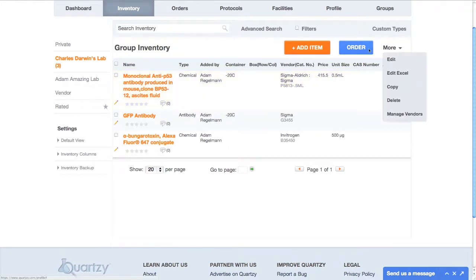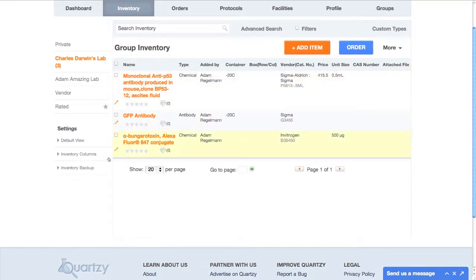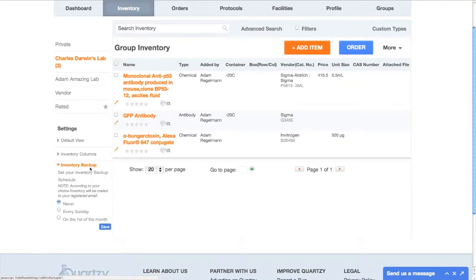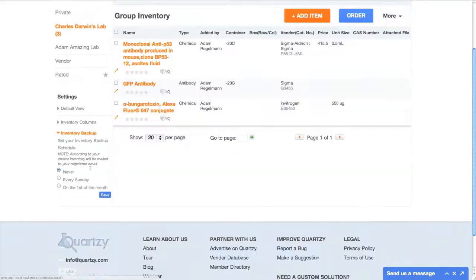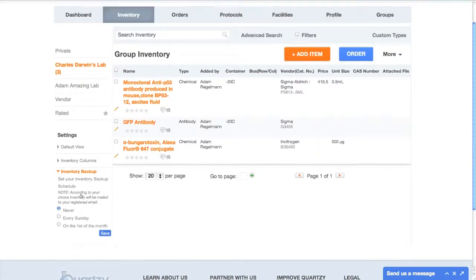Some scientists want to keep a local backup of their inventory. That's no problem with Quartsy. All you need to do is click the inventory backup setting on the left and select whether you want Quartsy to send you a weekly or a monthly backup.